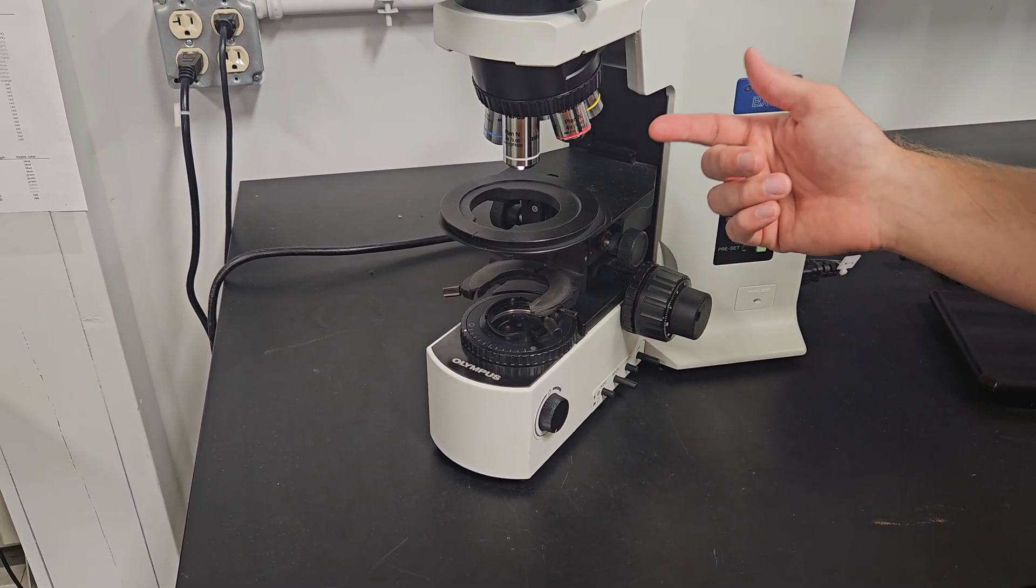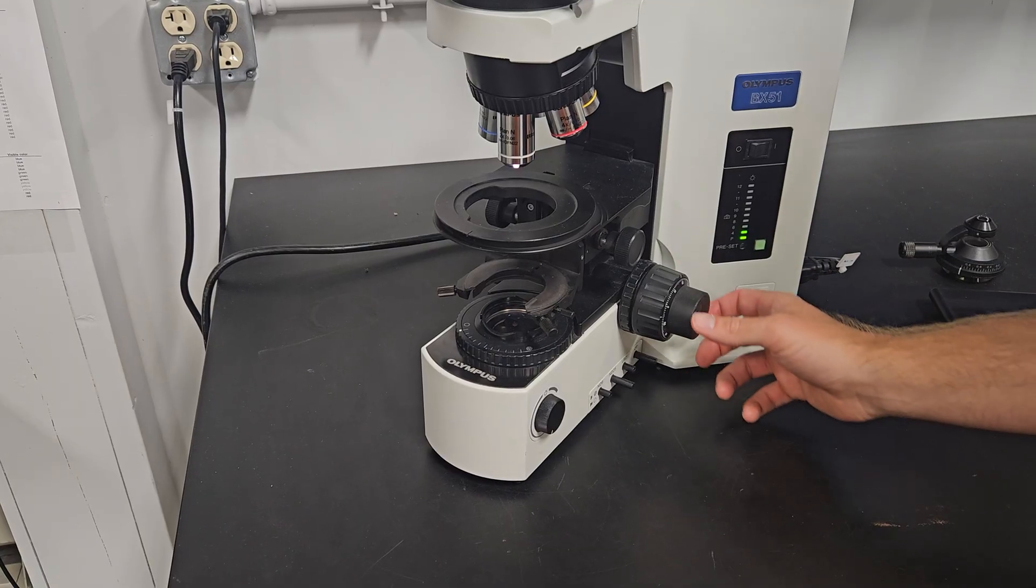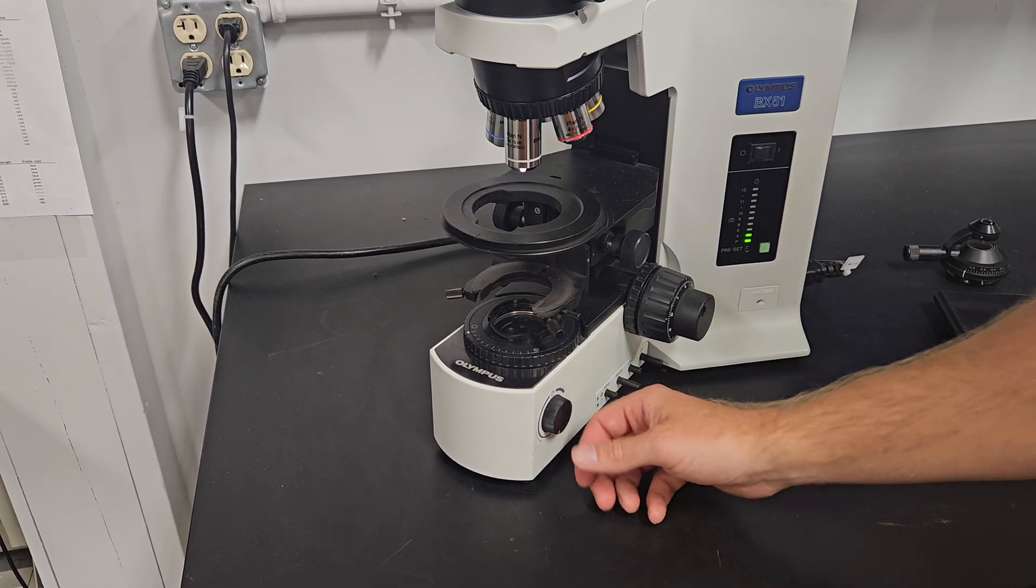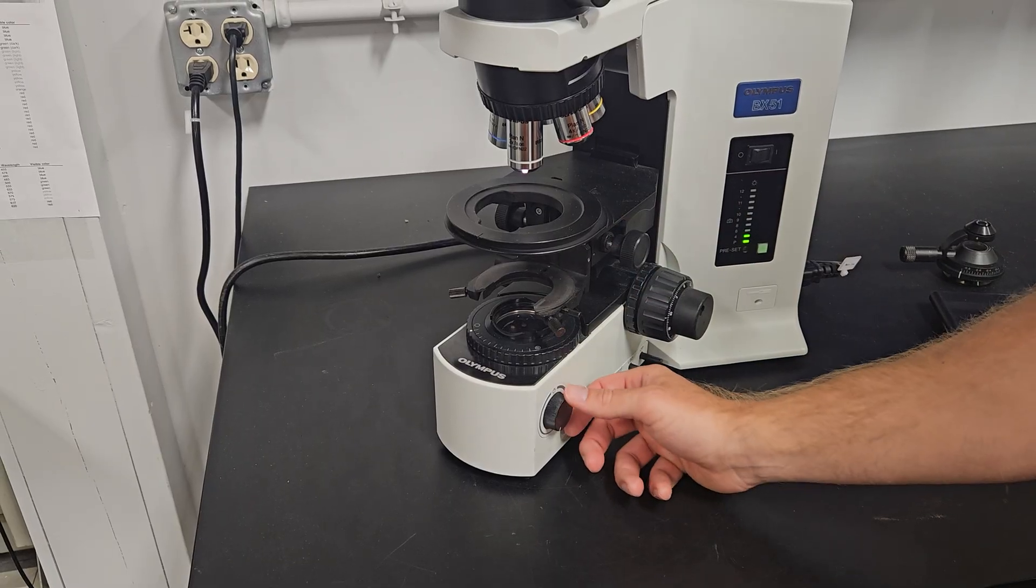So when you go from objective to objective, there's not a lot of focus. Specifications is within a quarter of a turn, but you usually can get it perfect. So there's no focus in between, which will help you with speed.